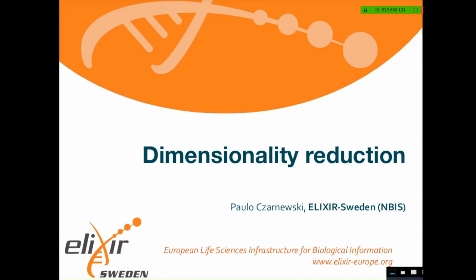I'm not going to go much into detail on exactly how those methods work, the math formulas and so on, I'll just skip that. What I want you to get from today is the intuition of how they work, and how you can use that information to tweak the parameters and visualize or reduce the dimensions of your data using PCA, tSNE, and UMAP. So my name is Paulo.